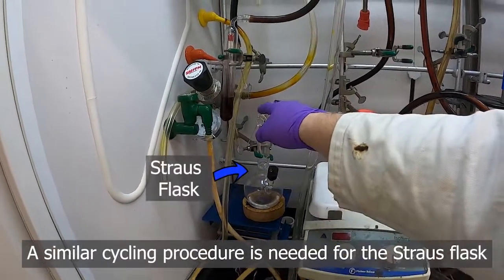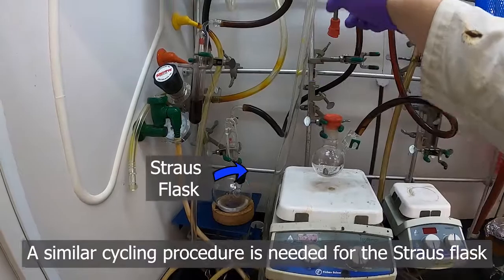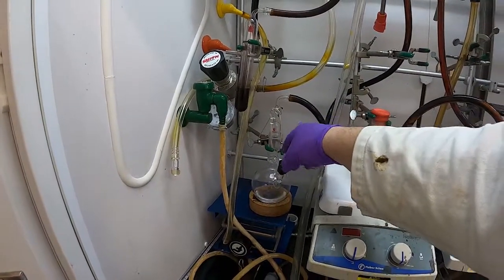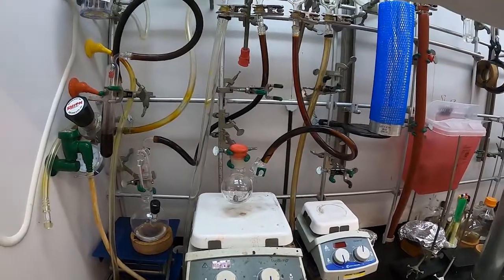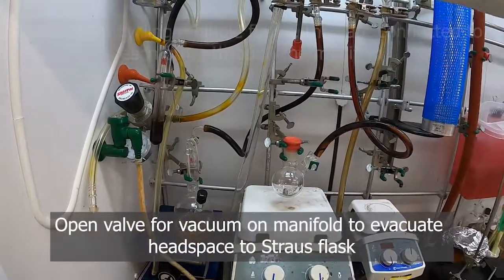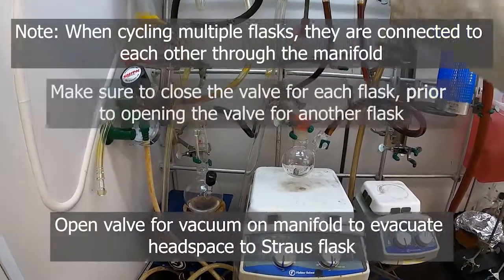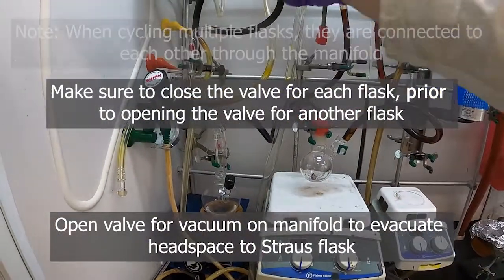We're going to do the same thing for the headspace. So the tube and this top area of our storage, our Strauss flask here. So we'll just open that vacuum. Since there's no solid in there, we don't have to worry about whether or not the tube is open to start. So we'll just put that vacuum right up.